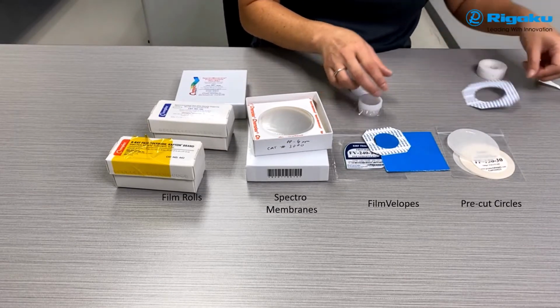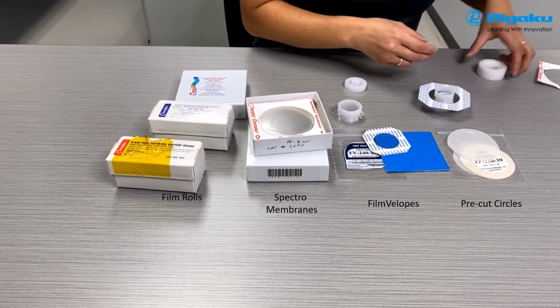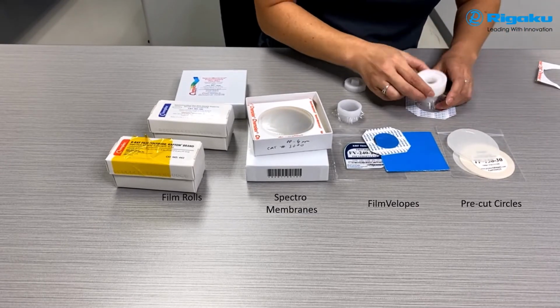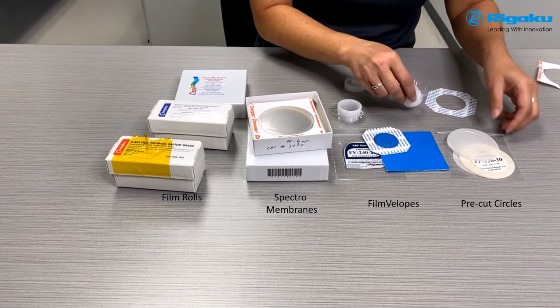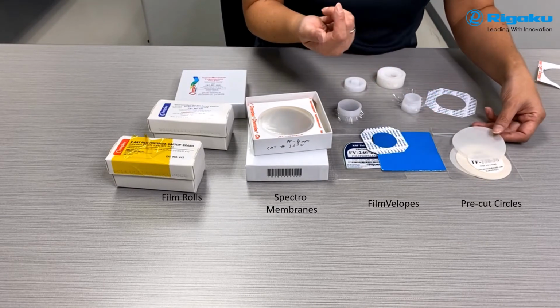So I like the film envelopes. Ton kind of likes the spectrum membranes, but I like the film envelopes because it doesn't perforate. It just kind of pulls away from the rest of the cardboard, so it comes out really nicely. There's no indentation. It's kind of like an envelope, that's why they're called film envelopes. They're very popular, and these are just the pre-cut ones made to the size that you need.